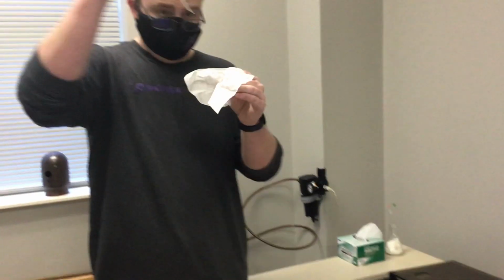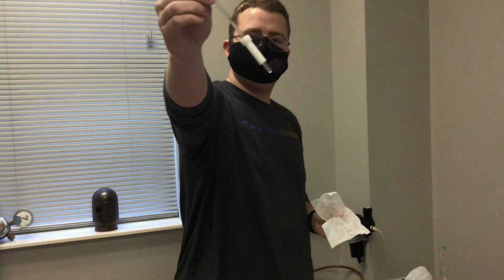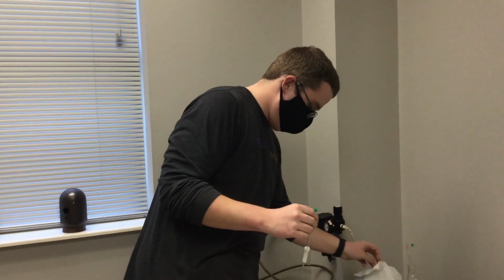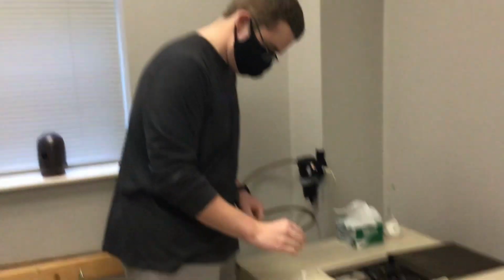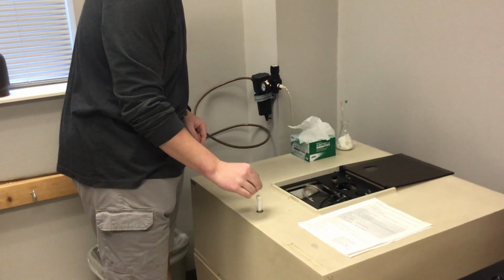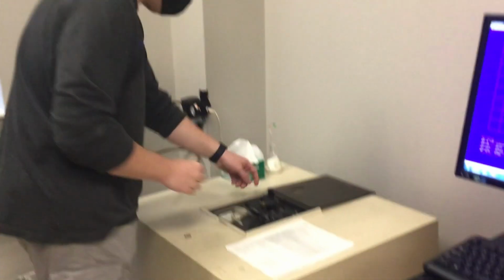And when you're done, pull the one you want to put into the NMR and just slide it just enough to see the bottom of it pointing out of the spindle. You don't have to worry about how far it actually needs to go up, because that's what this hole right here is for. You just take this, put it in, push it down until it stops, and it's ready to go. That's all you have to do.